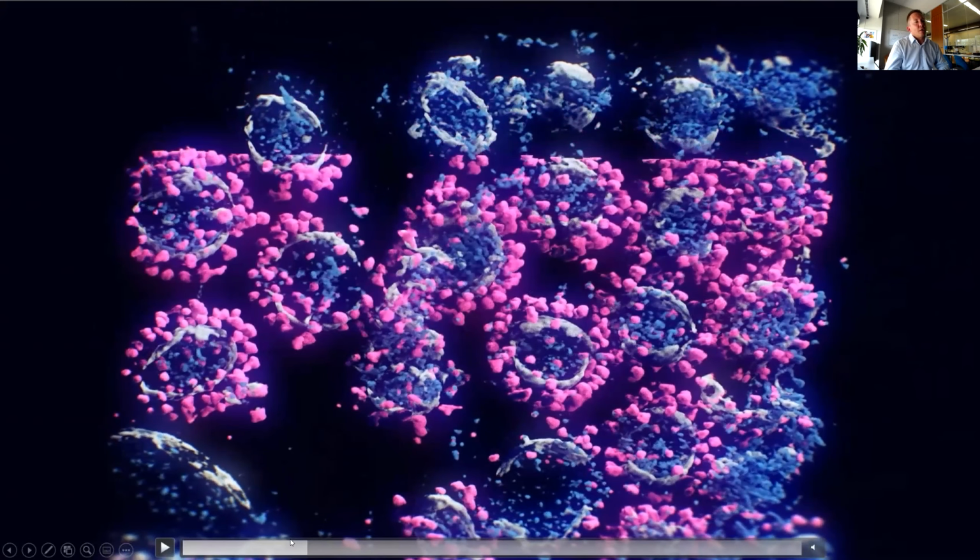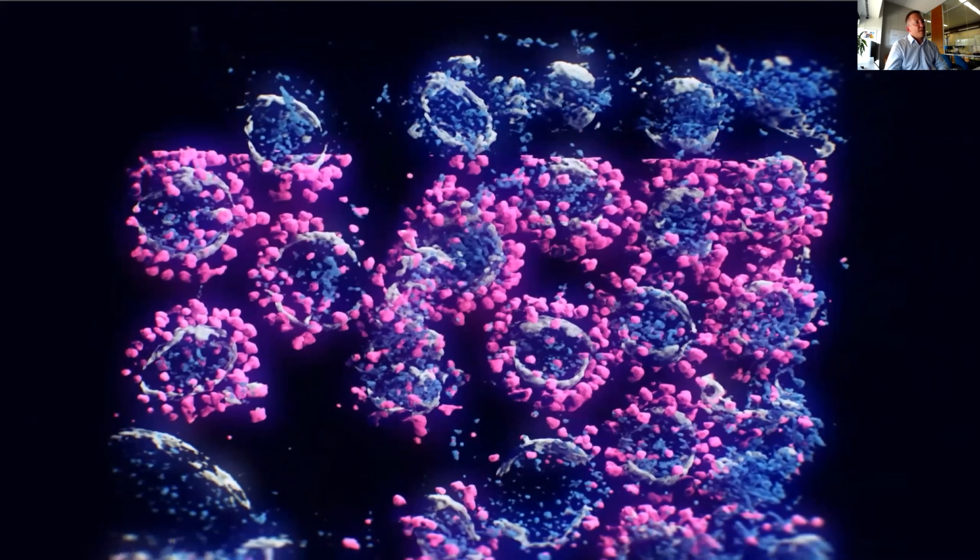The very next intermediate step is this: the work on the 3D visualization of the Cryo-ET data has been done before our work on Cryo-ET tomographic reconstruction, both with the traditional algebraic reconstruction approaches coupled with denoising, and with our differentiable microscopy methodology. So we have been using quite noisy projections.